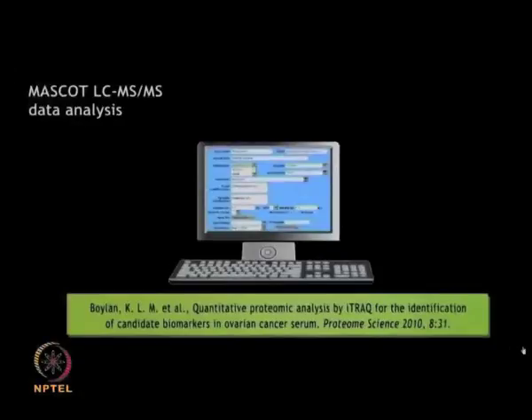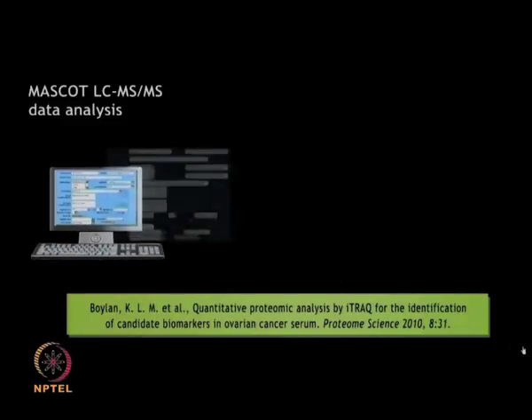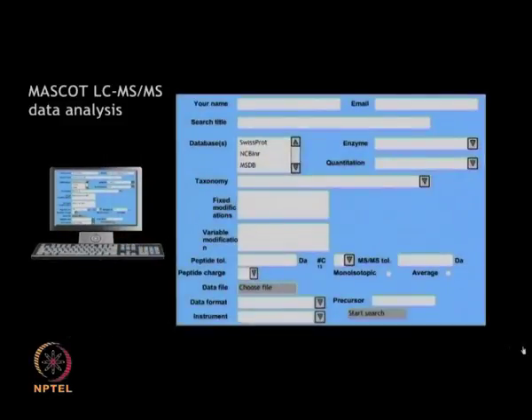Once the iTRAQ experiment is completed, the data obtained from tandem mass spectrometry can be analyzed by using Mascot and other software.